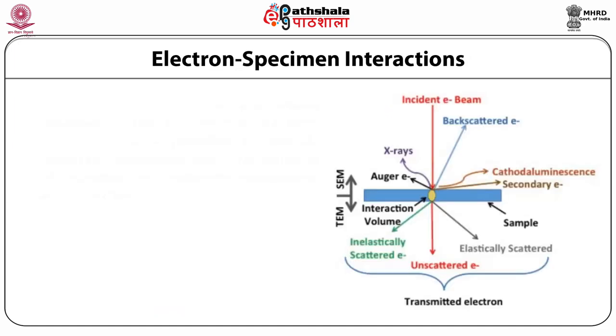Electron microscopy is a technique that offers unique possibilities to capture images at nanometer resolution for understanding the structure, topology, morphology, and composition of a material. Primary electrons, after collision with atoms in the specimen, impart energy to the specimen, resulting in a loss of energy or change in momentum of the primary beam electrons that gives rise to the production of an equivalent amount of energy in other forms.